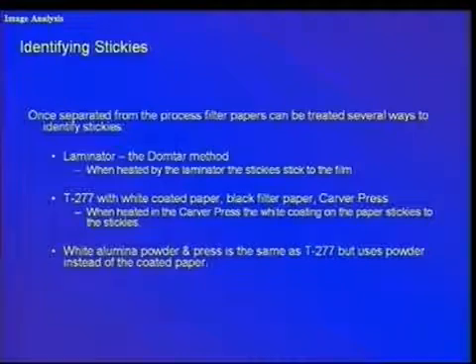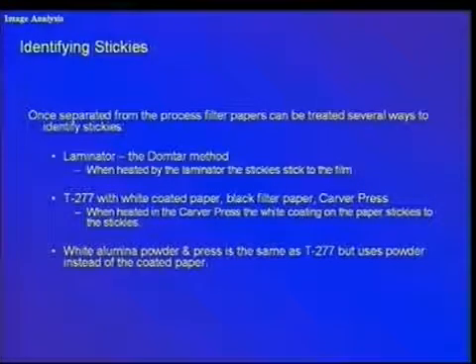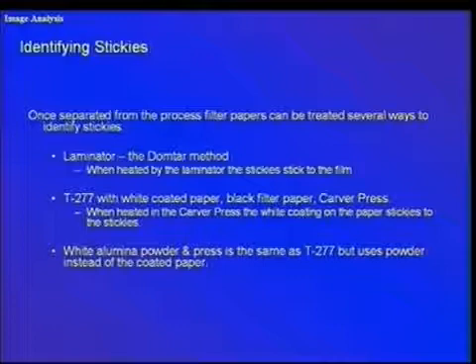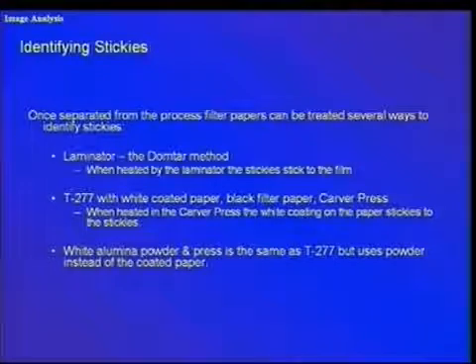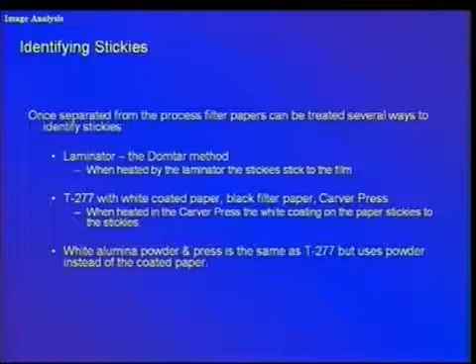The second method is TAPI 277, where the white paper that was developed by Voith and is available from them, containing an aluminum oxide coating, or maybe a calcium carbonate, lightly adhered to the paper, comes off when a Carver press is closed at a known pressure and temperature.